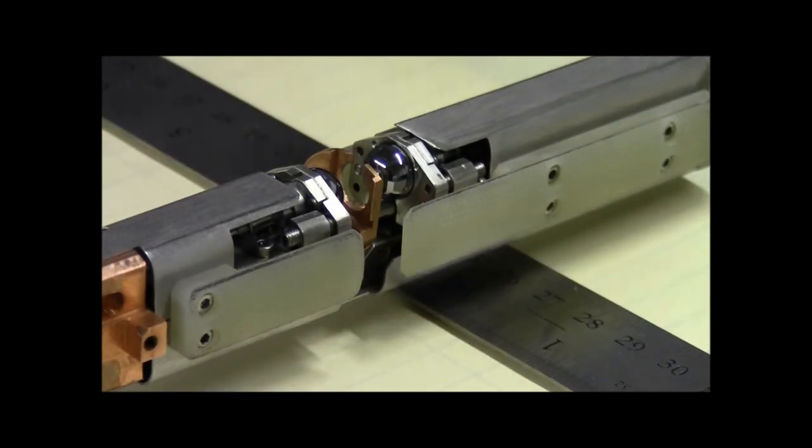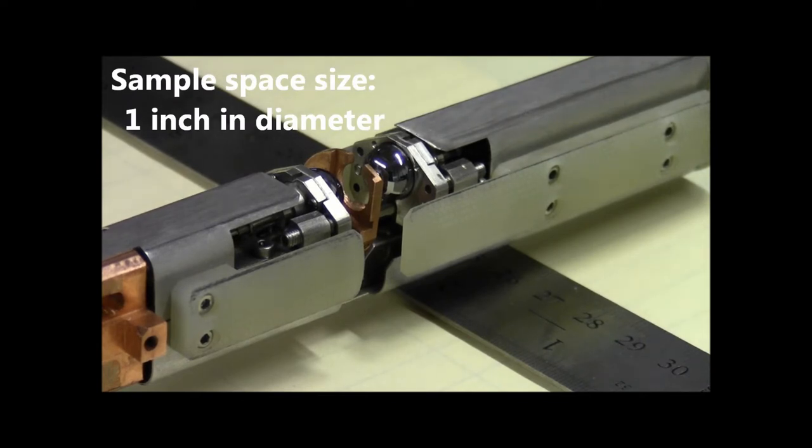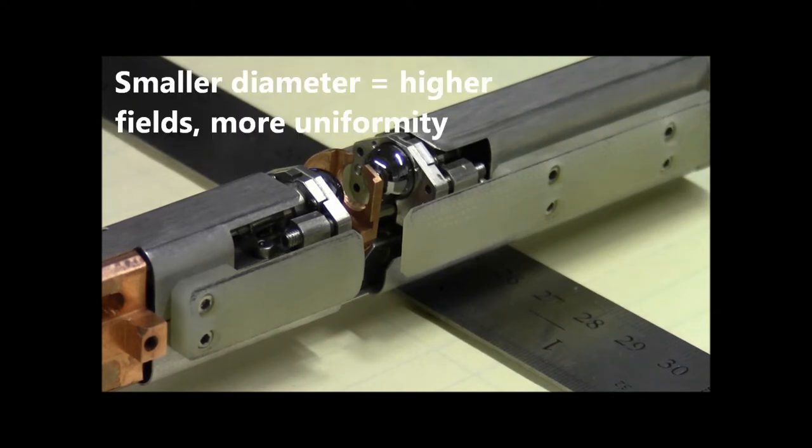This is the sample environment for the terahertz frequency materials characterization system. The first thing you'll notice about this sample space is its size. The overall dimension is actually a little over one inch in diameter, and the reason for that is it needs to fit inside a homogeneous magnetic field environment. The small diameter allows us to get higher fields with more uniformity to that field across the sample space.